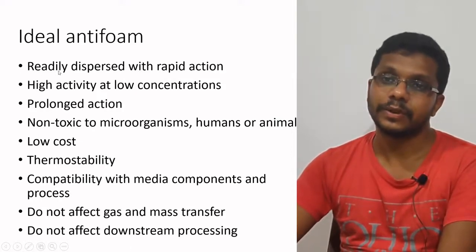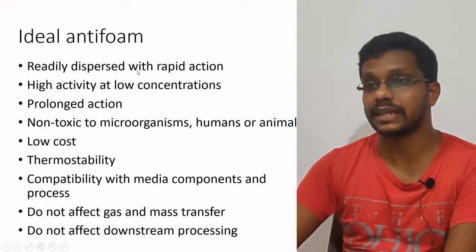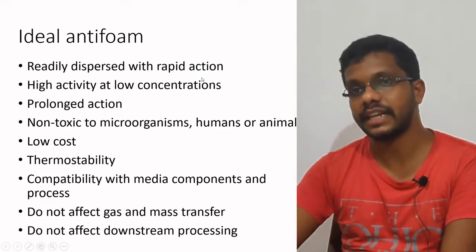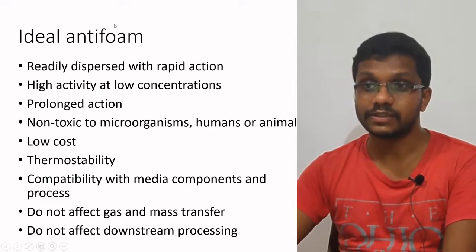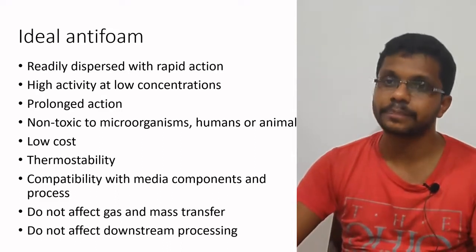The first point is that it should be readily dispersed with a rapid action. Whenever the foam is generated, we will pump the antifoam agent into the media, so it will disperse fast, and the action should be rapid. The foam should disappear quickly.